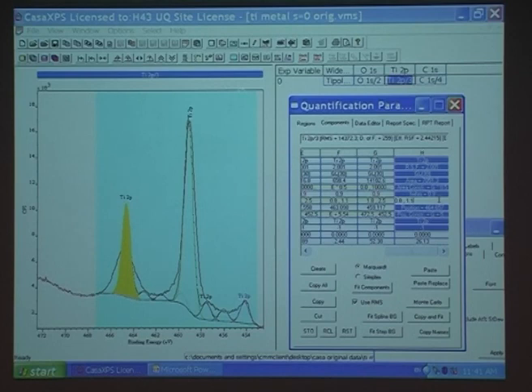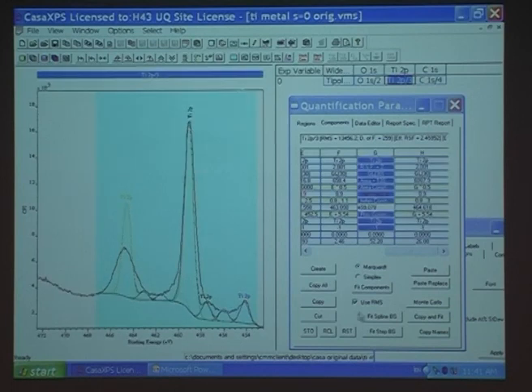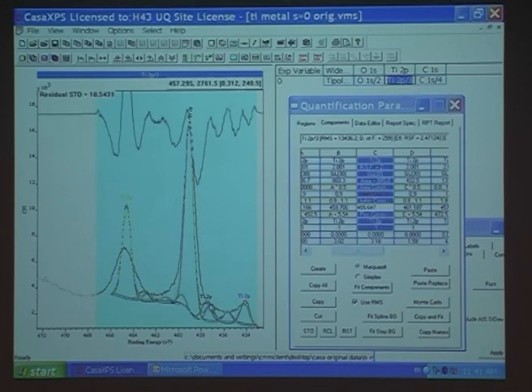This width has to be rather large because they are. I'll make that 3. No, it doesn't want it. Got to bring this one down. See, this is not so easy. These are much wider peaks than these. I think I might have to put in another set.